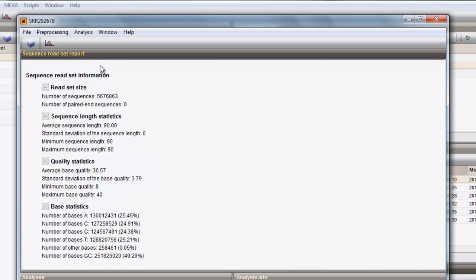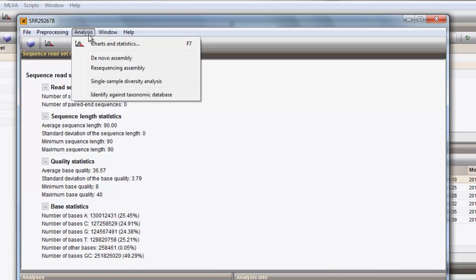From the sequence read set experiment card, one can easily launch analysis on the preprocessed data. Three analysis types are available: charts and statistics, assembly analysis, and metagenomics analysis.